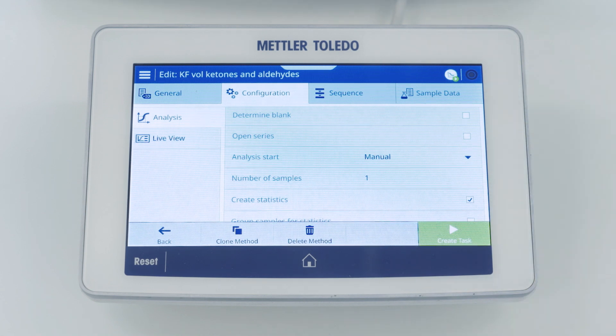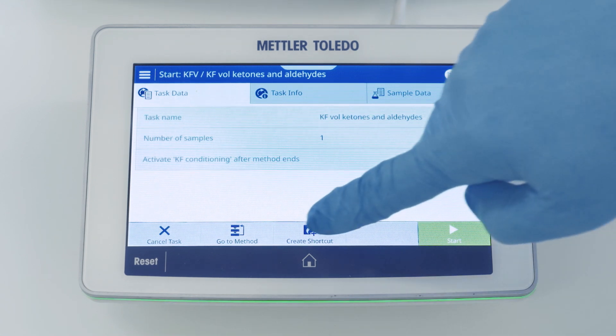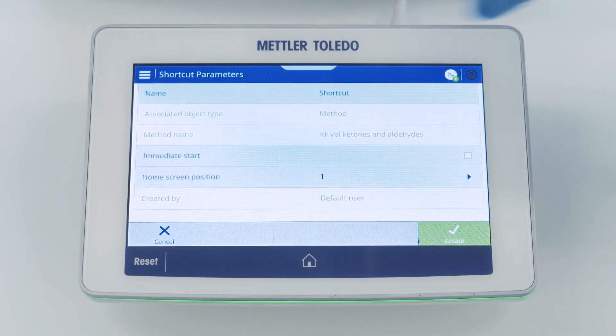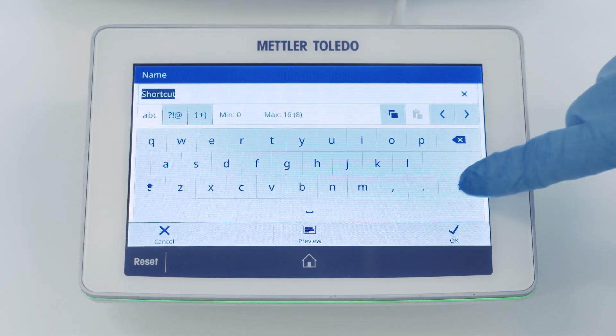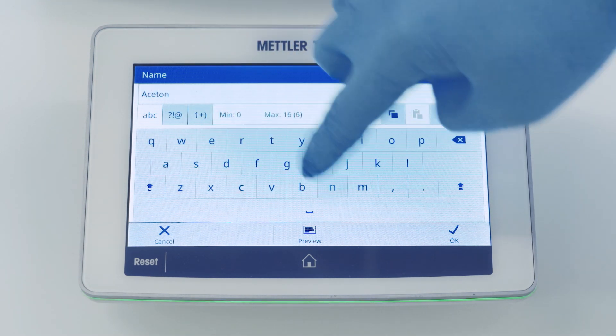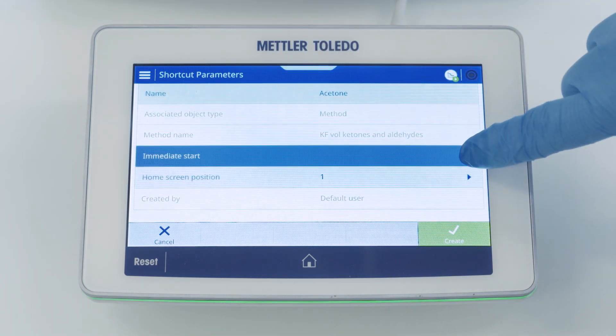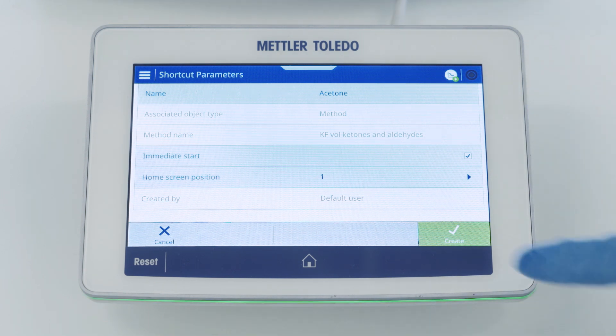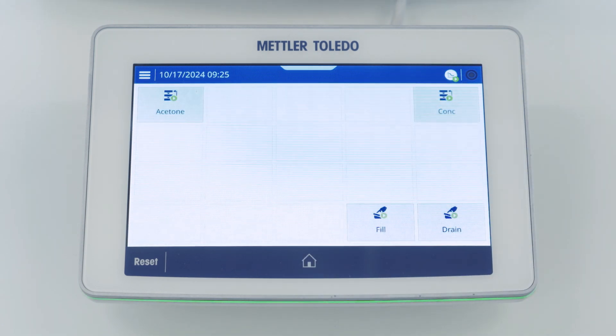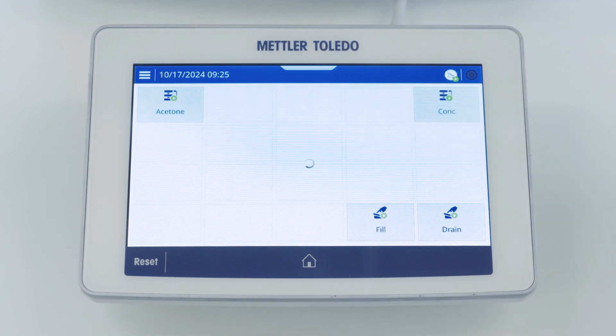Upon saving we create a method and to make it even easier we create a shortcut such that we can start the method from the home menu. We give a name to the shortcut, for example acetone, and we allow an immediate start of the method. Let's create the shortcut and go to the home menu. Now we can find the shortcut and start the method with one click.